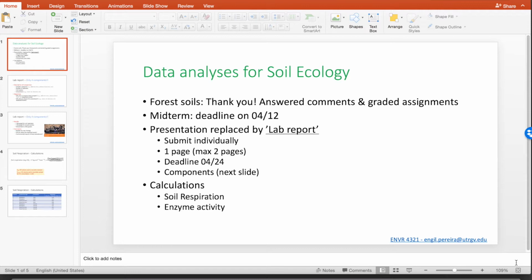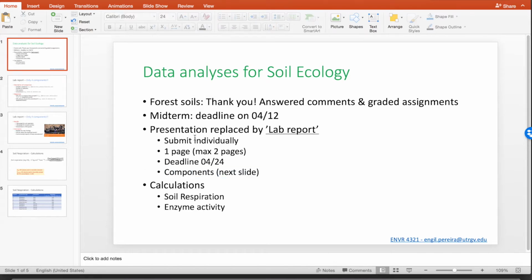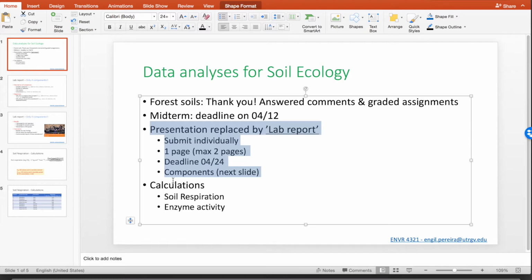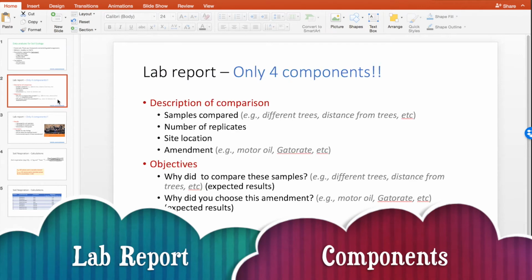And on the next slide, I'm going to go over the components that we need to see on your lab report. Okay, and so after we talk about the components of the lab report, we're going to go over the calculations for your data. First, we're going to talk about the calculations for soil respiration and then for enzyme activity. So today's video has the purpose of going over these 3 things: the lab report, the data for soil respiration, and the data for enzyme activity.